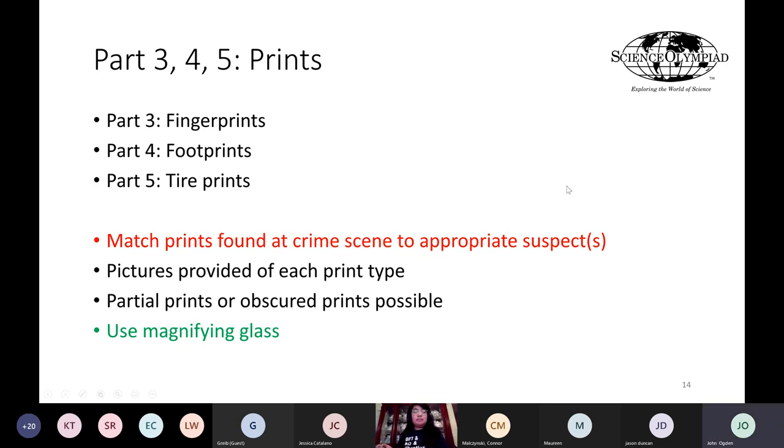Okay, we have another question. Is the chromatography paper already marked with the ink, or do the students need to create their own with pens given? So the chromatography paper will already have the ink samples on them. They're just responsible for putting the paper appropriately in the cup with the rubbing alcohol.